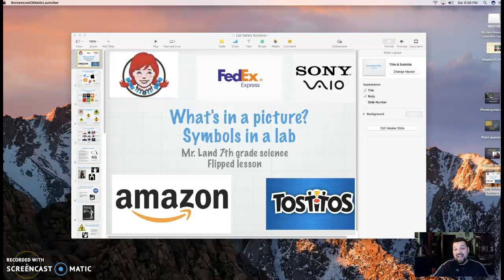Guten Tag, students. Welcome back. Mr. Land here. Let's do a lesson on lab symbols. All symbols, folks.